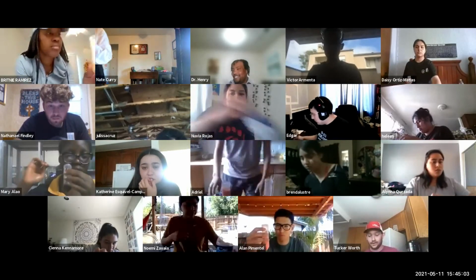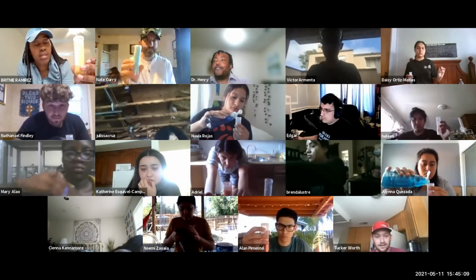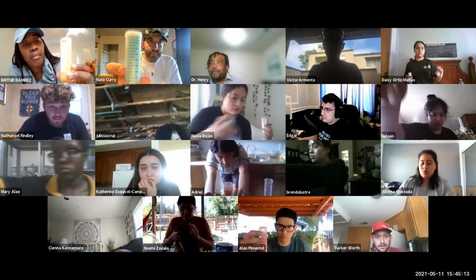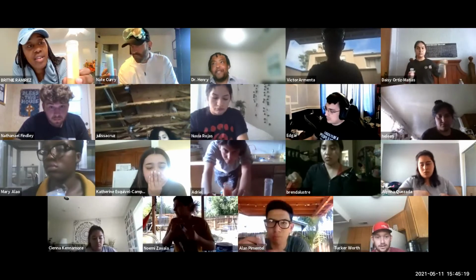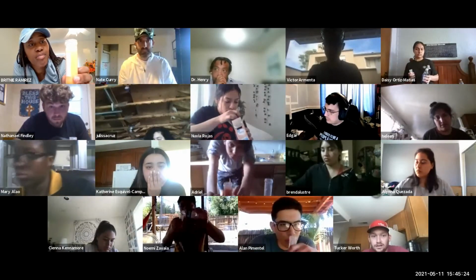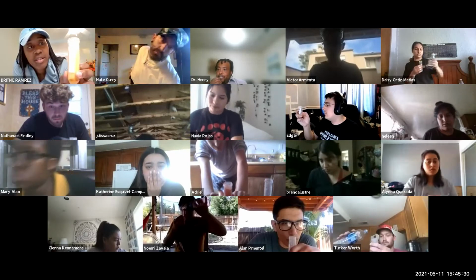Do I calculate with the 45, or do I just do it going over? So that's the point. If it went over, if it didn't flow out, mine went over the top this time. Mine didn't. So did you get the same results, Vicky? No, the first one was 50, the second one was 45. This one's like 43 point something. Okay. So your first one was 50, the second was 45, and this one is like 43 point something.